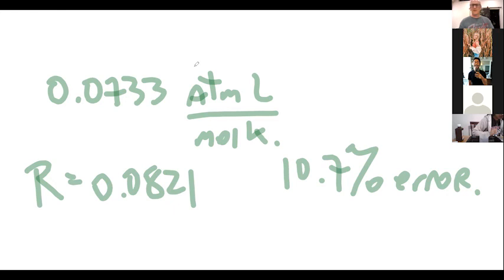which I think is pretty good. I will take that. I mean, let's face it, we're mixing yeast. We're pushing tubes together and trying to put things underwater, and still, with all that, 10% error, I'd take that any day of the week. So yeah, I think this experiment should work fairly well.